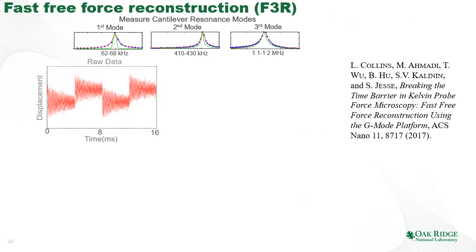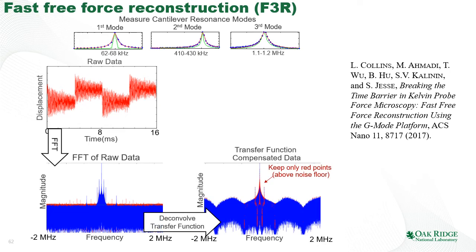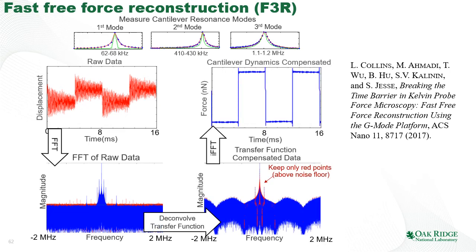And then what we can do is measure the displacement signal, Fourier transform it, deconvolute the transfer function, and then recover the force acting on the cantilever.